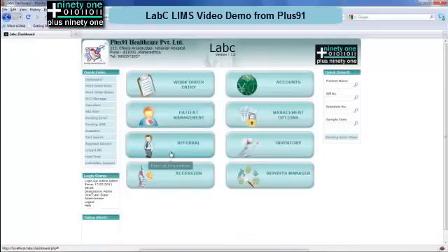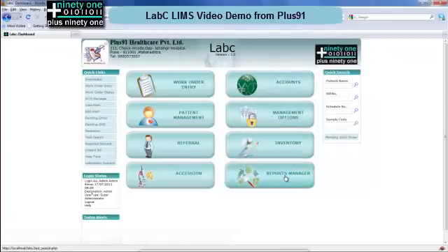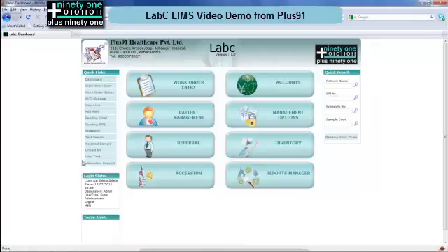Enter the username and password and click on the login tab. You will see a dashboard which includes the various modules of the software, a quick search bar and a quick links bar. Modules include work order entry, patient record management, referrals, accession, accounts, management of the software, inventory, and reports modules. You also have a login status bar as well as the display alerts bar.